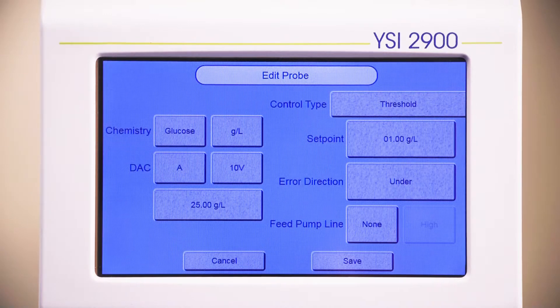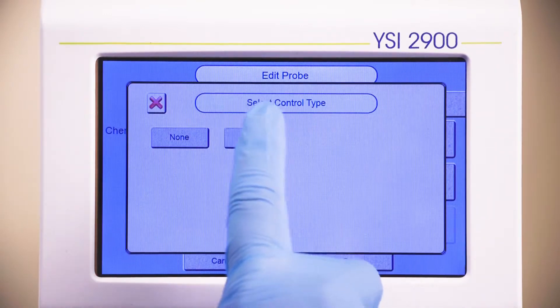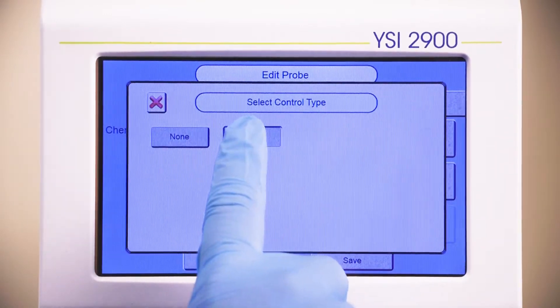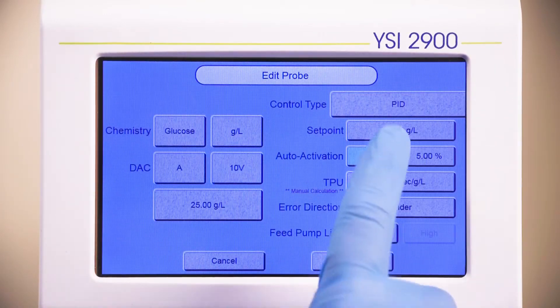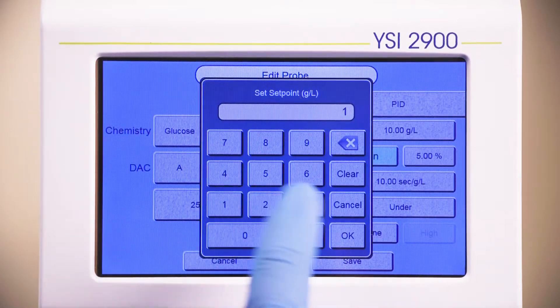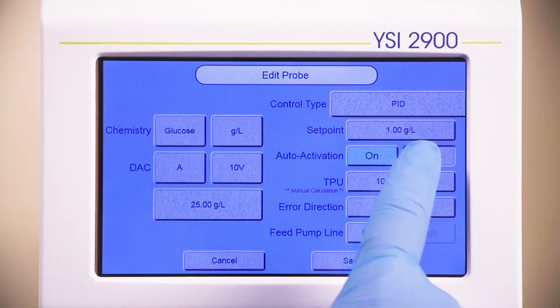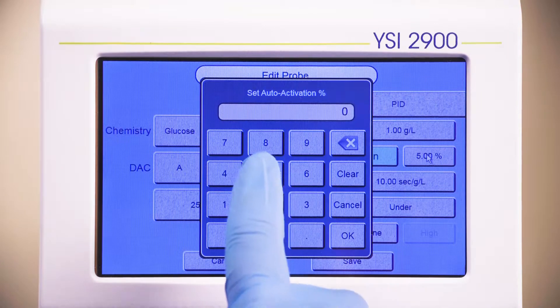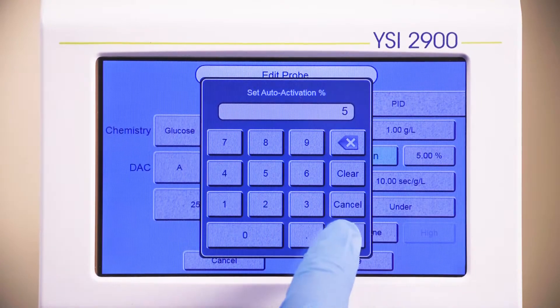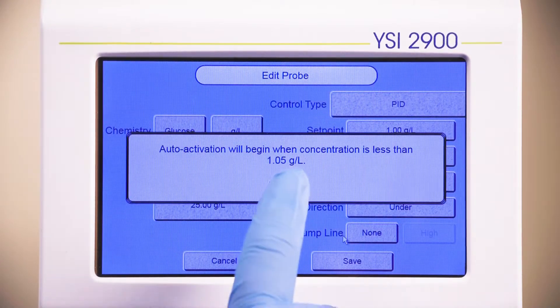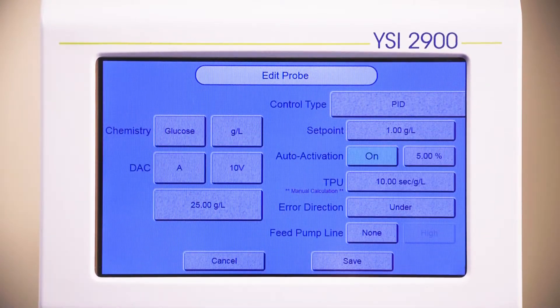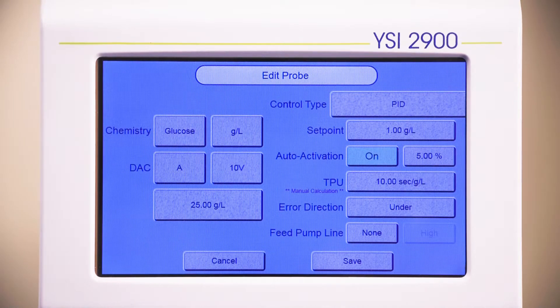If you select PID control, specify a set point. We will use 1 gram per liter. Set Auto-activation to ON and set the percentage in the field to the right. The percent and error direction will determine when the instrument starts running the control algorithm and when the instrument will send output signals.